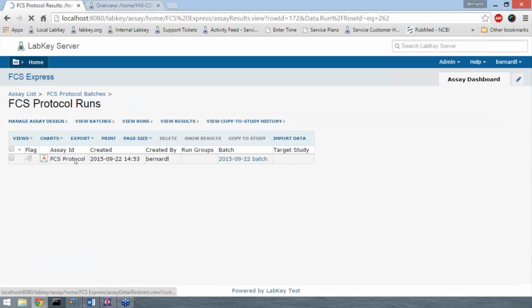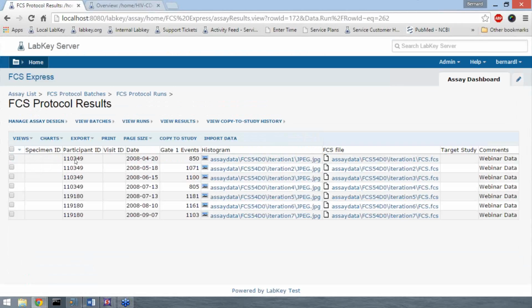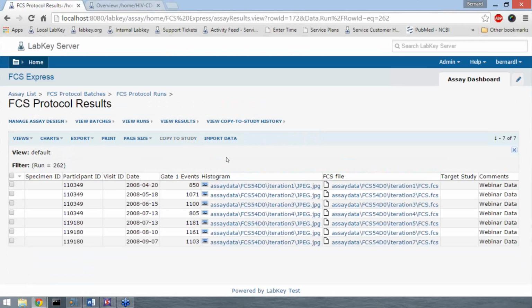Now, after export, you click on your file. Just the way that Kaya showed, you'll now get this data grid, and we are prepared to perform some sort of analysis or to create charts or reports. The fundamental data interaction feature of LabKey is this grid view that you see before you. It supports sorting, multifaceted filtering, as well as the creation of quick charts.